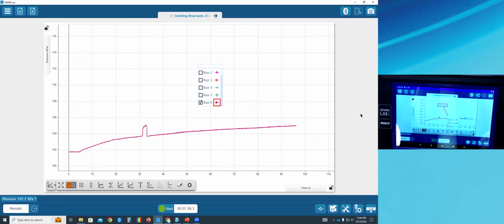Now it's yours. So that's called the shared session, and that's another way to share files with students, not only within the classroom, but anywhere in North America. The last time we did this, there were people from all over the United States and Canada who at the same time were all doing this lab together. It was wonderful. So now that's your file. You can save it. You can do analysis. You can do whatever you need to do on your file.